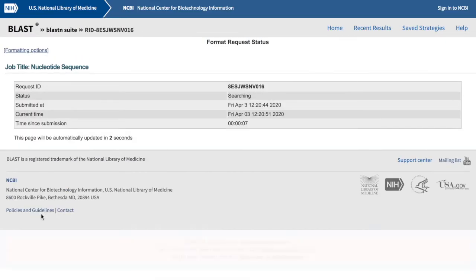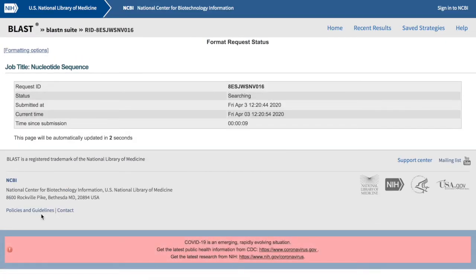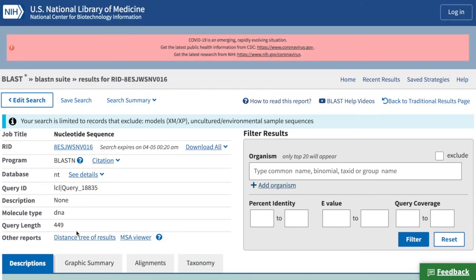Because the database is so big, sometimes it can take a minute to see your results, but the result page looks something like this.